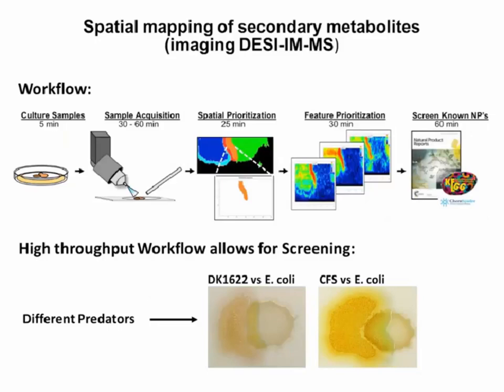With this imaging analysis, we felt confident that the method we had developed was conducive for our untargeted discovery efforts. Most importantly, the workflow that we have developed is accomplished in approximately 3 hours per sample, and I've highlighted several of the times for each step in the analysis in the top part of the slide.